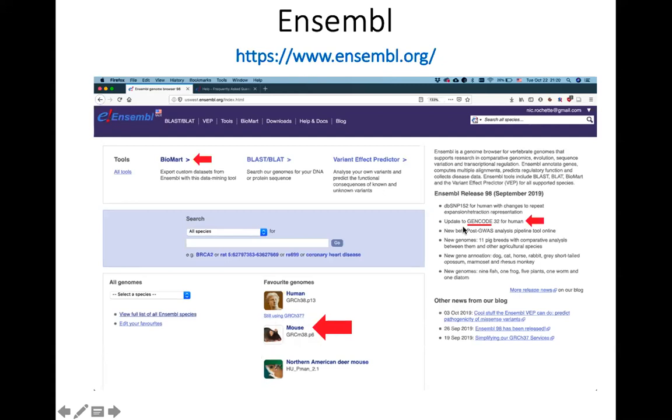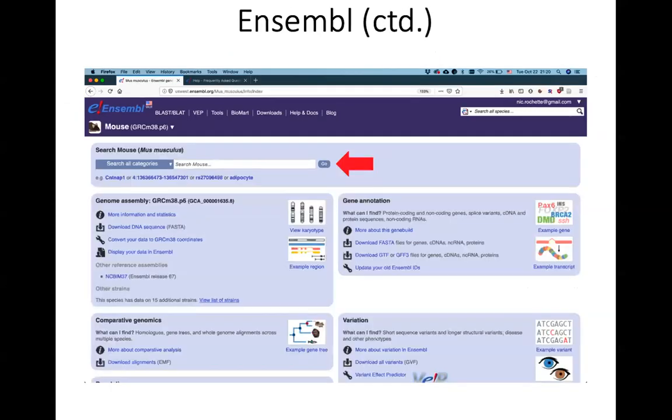Ensembl is good because, for mice and humans, the main annotation set is the GENCODE one, and it's actually maintained partly by Ensembl, and it can interact with a lot of different metadata databases, where you can cross it with all sorts of other types of biological data very easily. It just works well. So if we click on mouse, we arrive at this page for the mouse genome. We can browse online on the Ensembl viewer, and just enter a gene name.